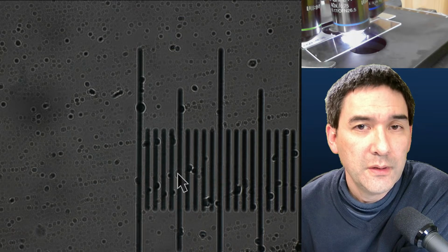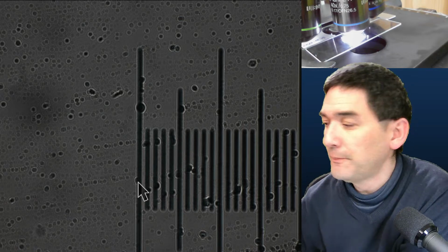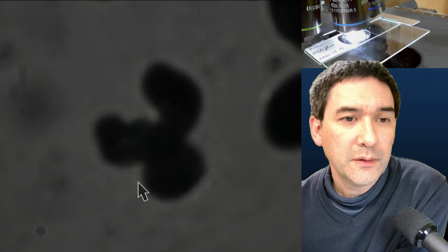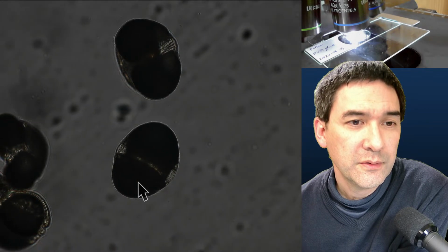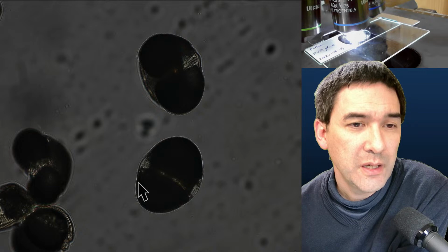Okay. So, let's now have a look. If this is, let's say, the width of my arrow, the width of my arrow over here right now goes approximately from one line to the next line. Now let's go and find a pollen, and let's focus a little bit here. Let's just use this pollen grain here. How many times across? Maybe 5 times across.